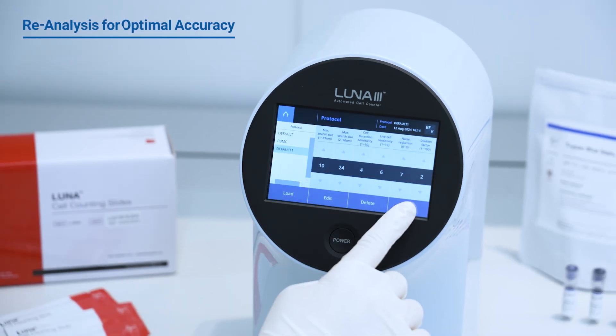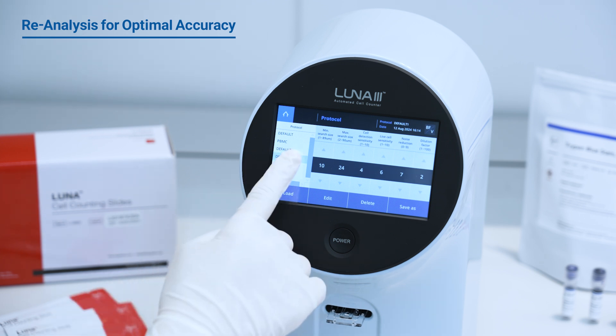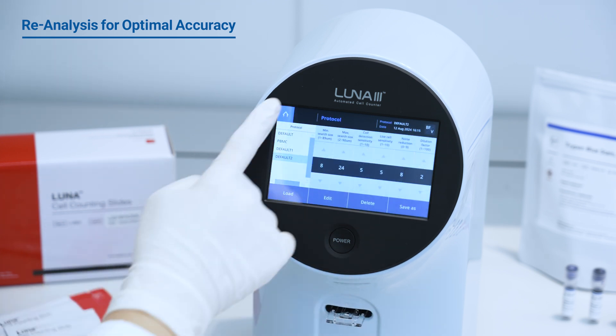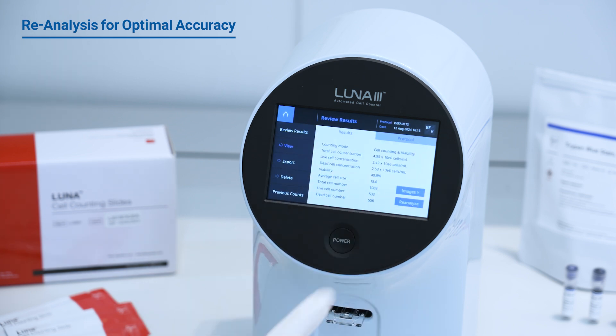Adapt and optimize effortlessly with the Luna series, which allows reanalysis of saved images using different protocols. The Luna 3 takes it a step further, delivering reliable results without the need for additional sample preparation.